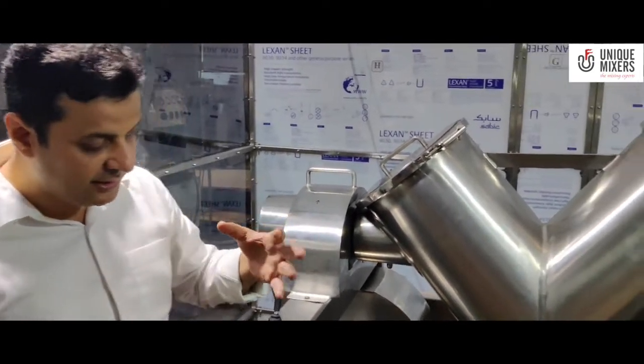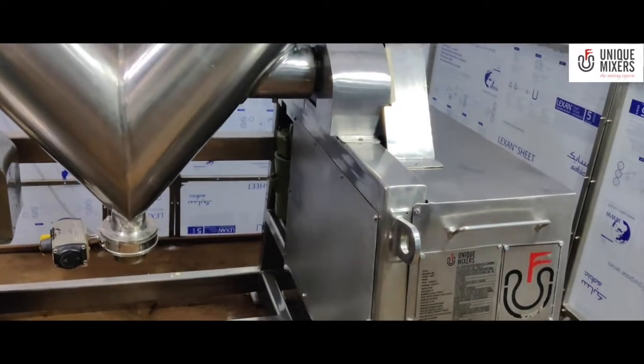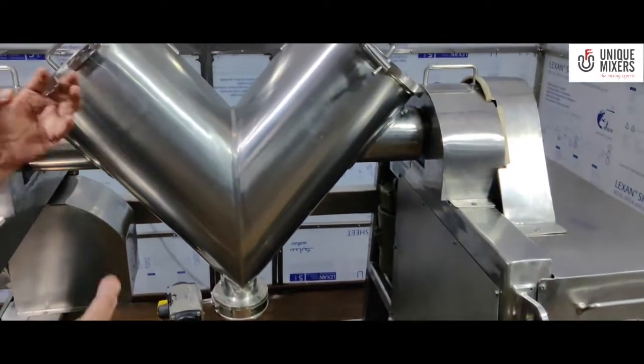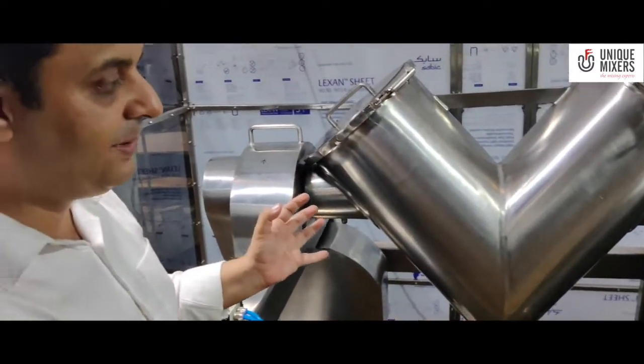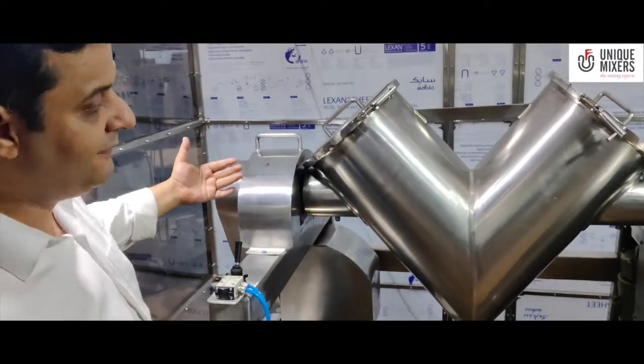It runs at a very high speed. The drive system comprises of a primary motor. It has a dual shaft and we have a thruster brake so that the position of the machine can be done accurately. We have a reduction gearbox and then we have the blender rotation.